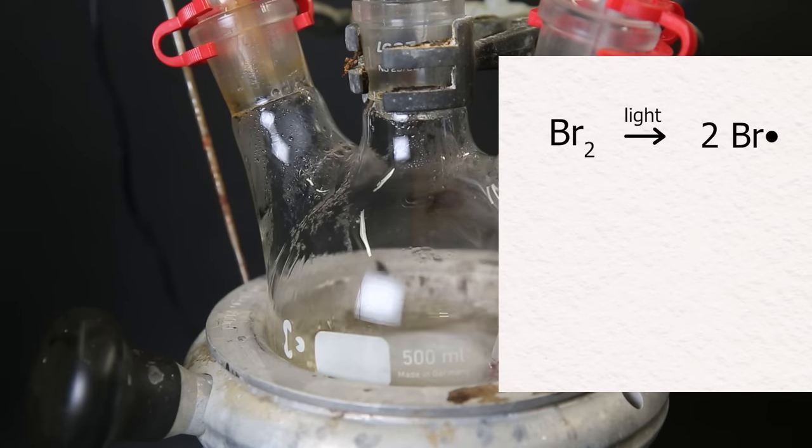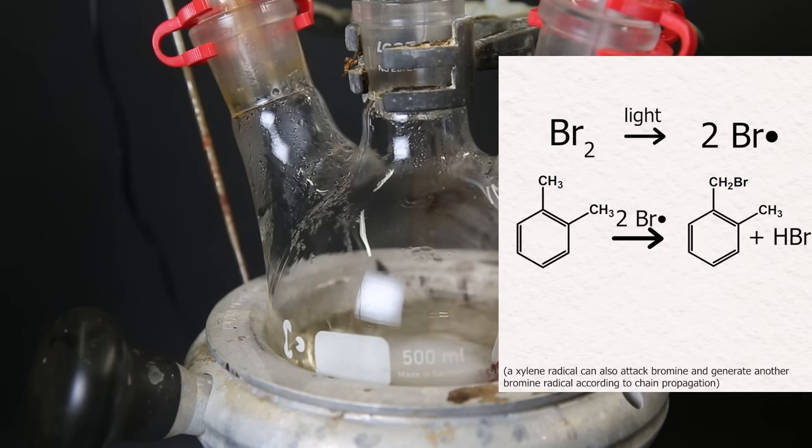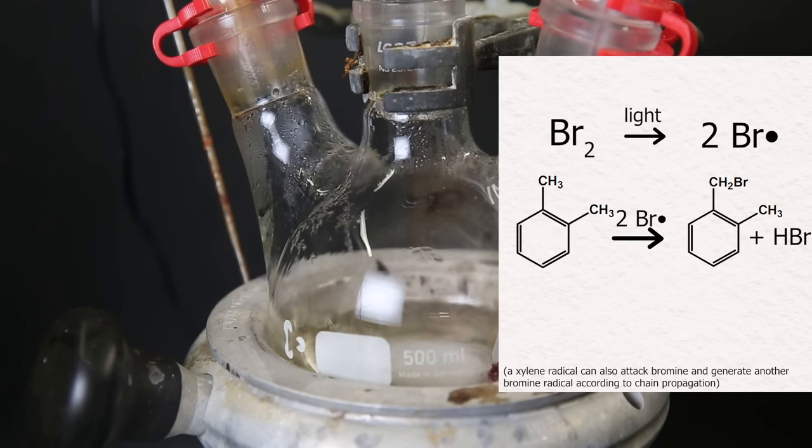So what will happen is the light will assist in producing bromine radicals. When hit by a photon, bromine will fall apart and produce two radicals. These radicals can steal a hydrogen atom from the xylene methyl groups, which in turn allows for another bromine radical to attach itself there. This produces a monobrominated xylene and hydrobromic acid. This process then repeats itself on the other methyl group to produce the dibromide.